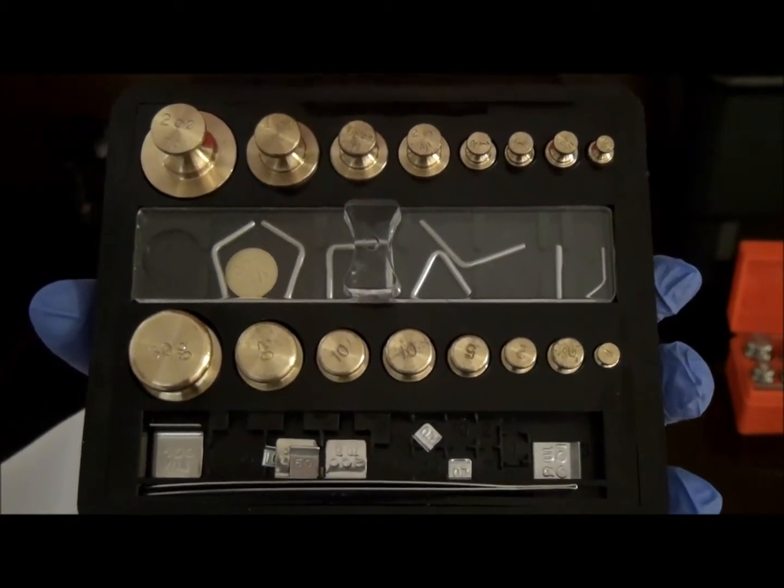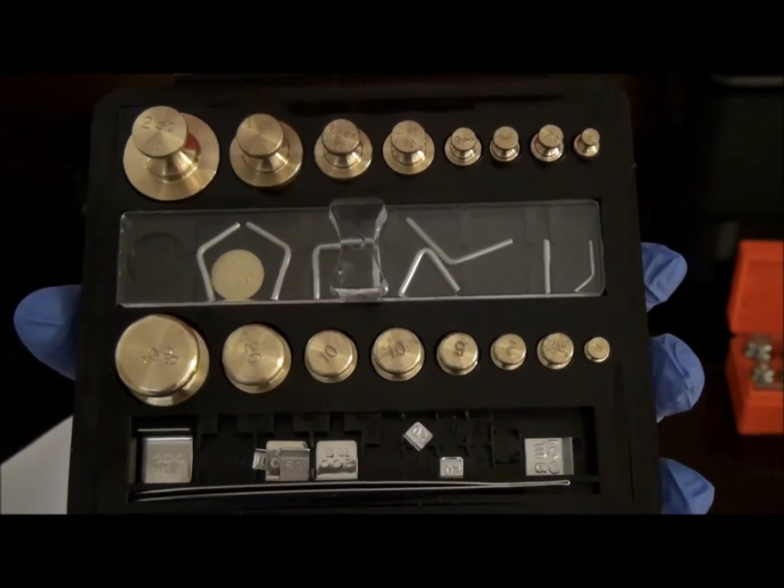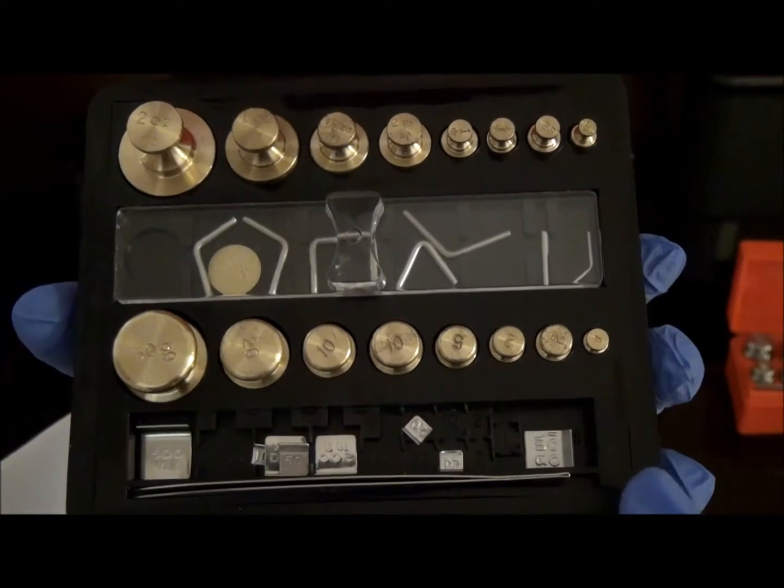Metric weights used exclusively for analytical purposes may come in a range of one milligram to one hundred grams. This weight set comes in a range of one milligram to fifty grams.